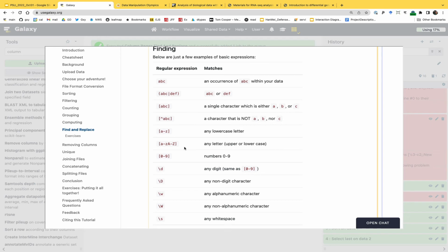For example, there could be a situation in which your gene names contain something you want to convert to uppercase or lowercase, or your gene name contains several parts separated by a dot, for example, and you want to get rid of one of those parts. There's an endless amount of situations in which you can do this matching, and so you create a pattern.